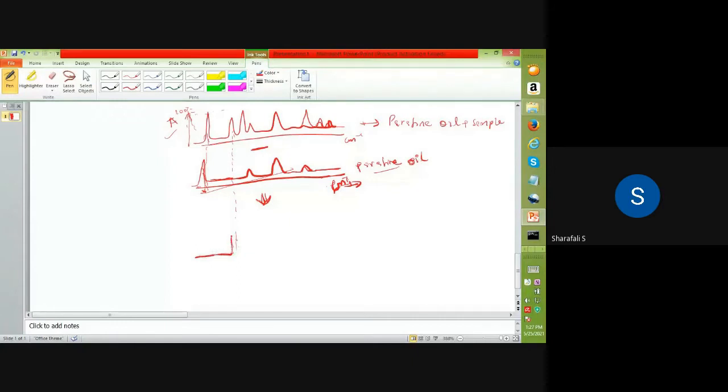So we will be having that spike. And in the next, we have a very small spike here also, this particular spectra, which is also present in there. And then the next one, which will not be present, because we have this particular band at the same frequencies with the same intensity, which is associated with paraffin. When you subtract that, you will not be getting that.